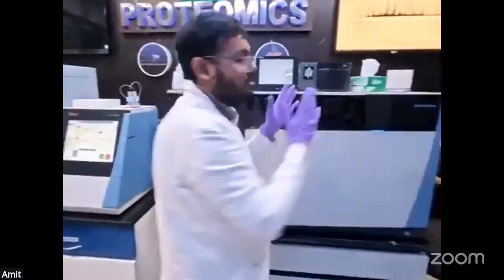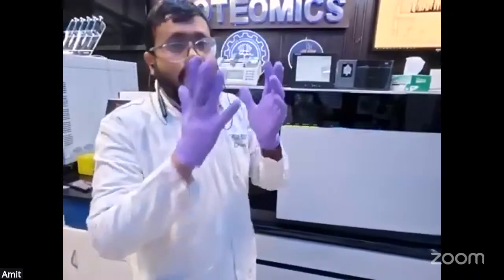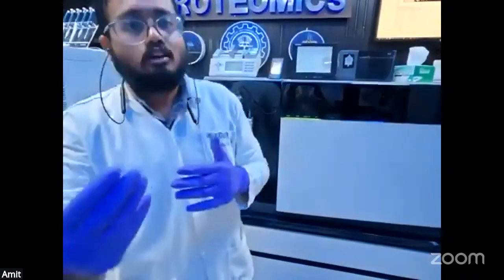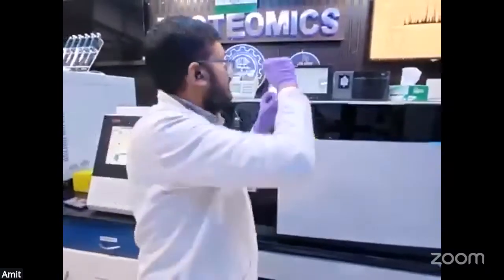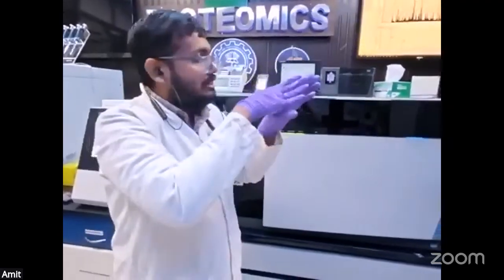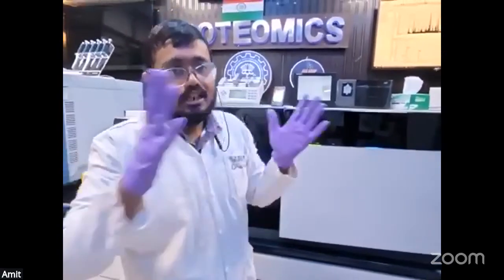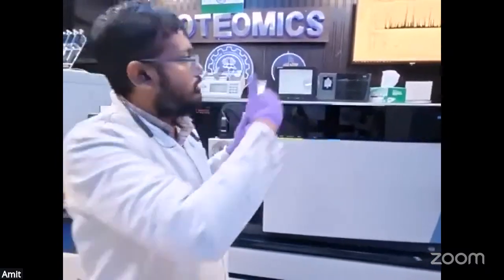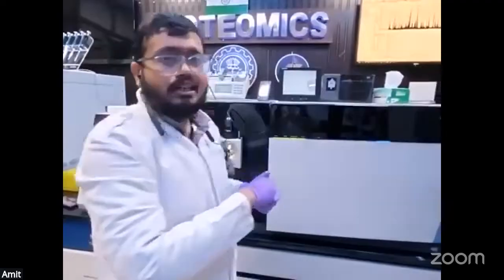Next, it contains two more mass analyzers. One is the Orbitrap and the other is the ion trap. You can couple the quadrupole with the ion trap, or you can couple the quadrupole with the Orbitrap. In between there is a C-trap, which captures the ions and then, according to the method and parameters that you give, distributes the ions. This gives us enhanced separation with superior resolution and greater sensitivity. This instrument can go to a very high resolution of 120,000, with greater speed and accuracy.